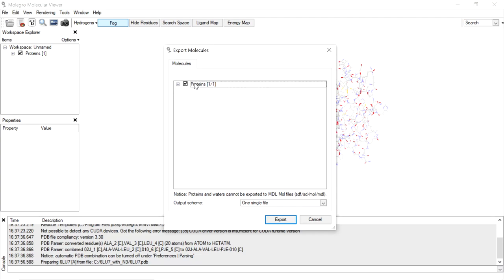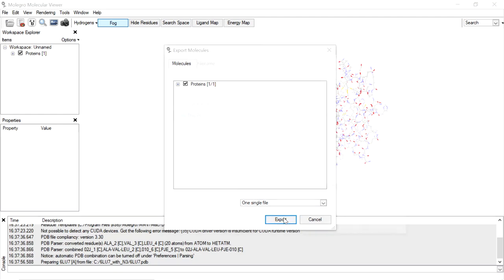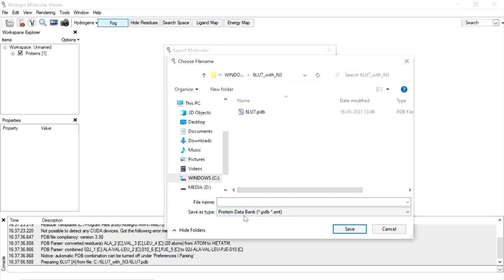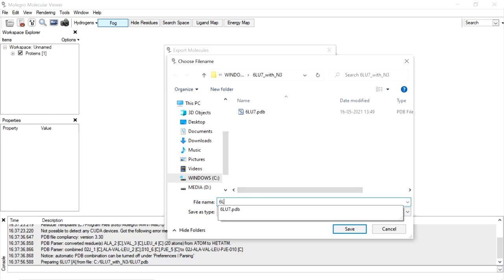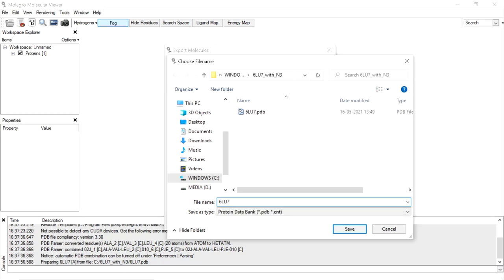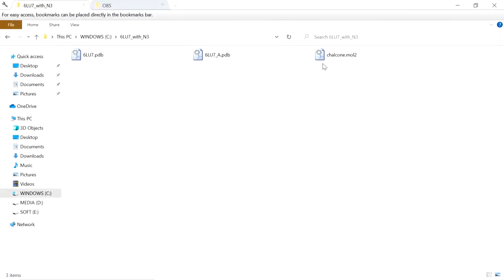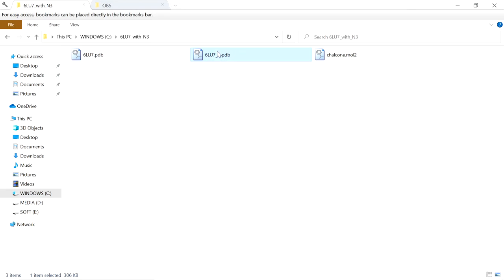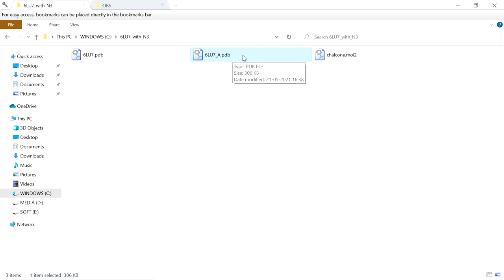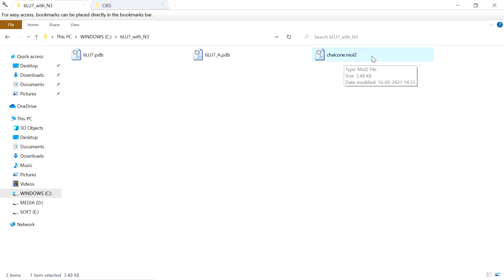While exporting, select only the protein entry. Set the format as Protein Data Bank and give the file name. Now the protein is saved. This protein molecule does not have water or ligands — it contains only the amino acid residues. We are going to use this file in AutoDock Tools.